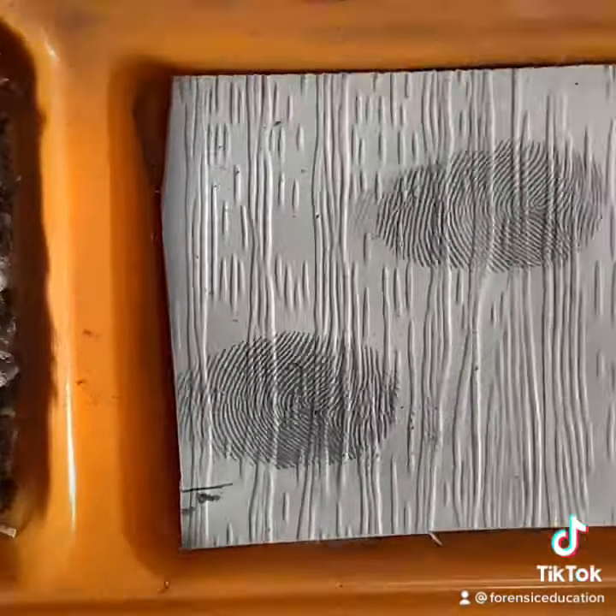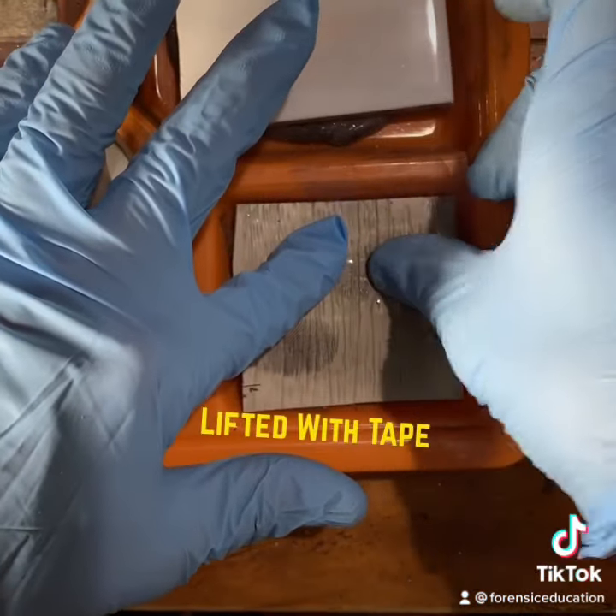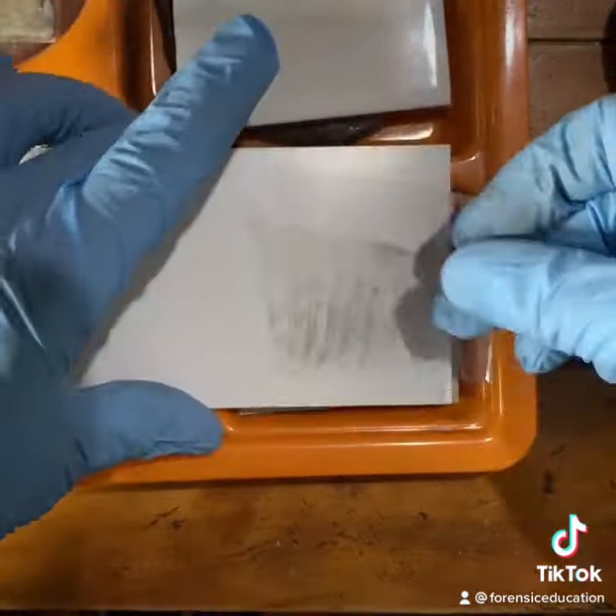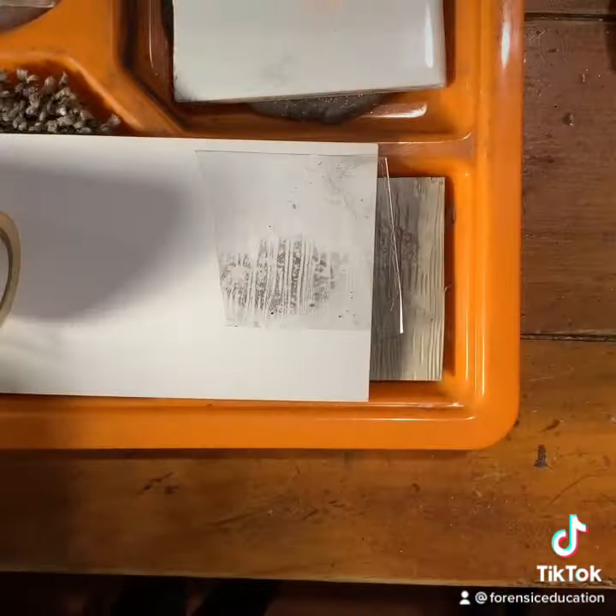To lift this, we've got two different ways to do that. The first one we're going to try is just with a flat tape. If we lift with a flat tape, what you're going to see is it's missing lots of detail. Look at that — that's terrible.